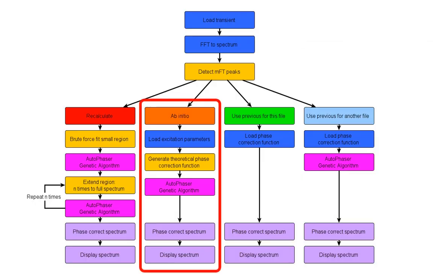The ab initio mode of phasing works for Bruker ICR files that contain information about how the ions were excited inside the ICR cell. Autovectus can then use that information to calculate the theoretical phase correction function for that spectrum. Unfortunately, this theoretical mode can't be used for Orbitrap spectra because there's no information stored in those files that could be used to create a theoretical phase correction function. And even for ICR spectra where the theoretical phase correction function can be calculated, it's usually not accurate enough to be used by itself, as space charge effects and other instrument issues can adjust the true phase correction function. Therefore, Autovectus uses the theoretical phase correction function only as a starting point, and then applies its genetic algorithm to optimize the phase correction function to the ions that are actually in the data.